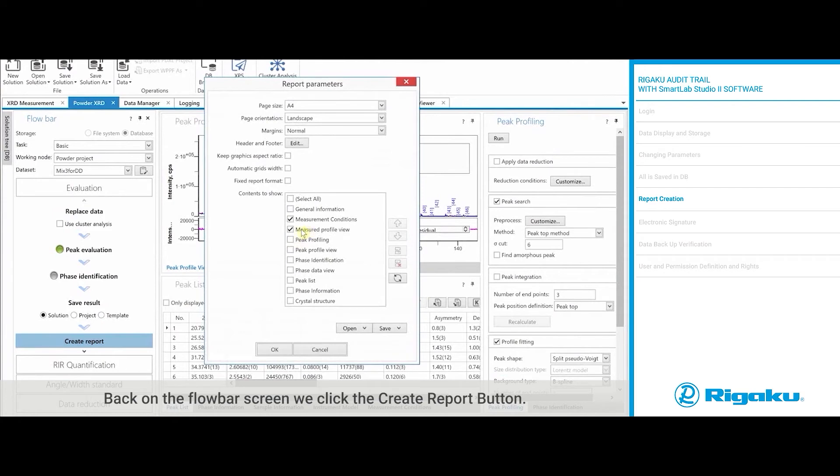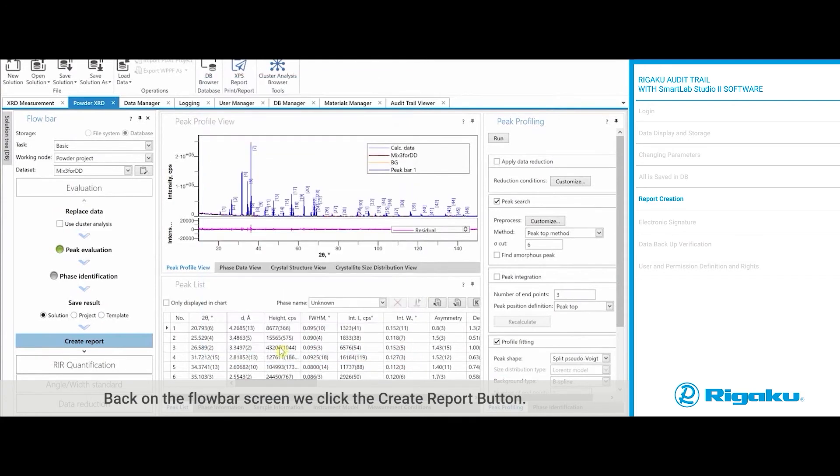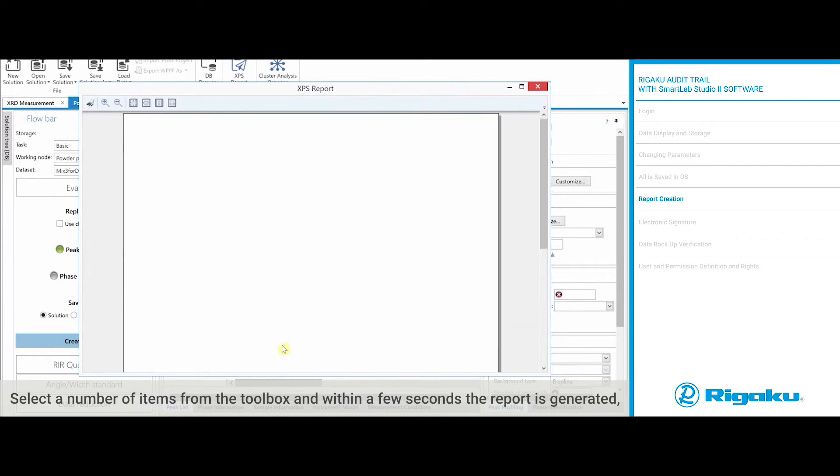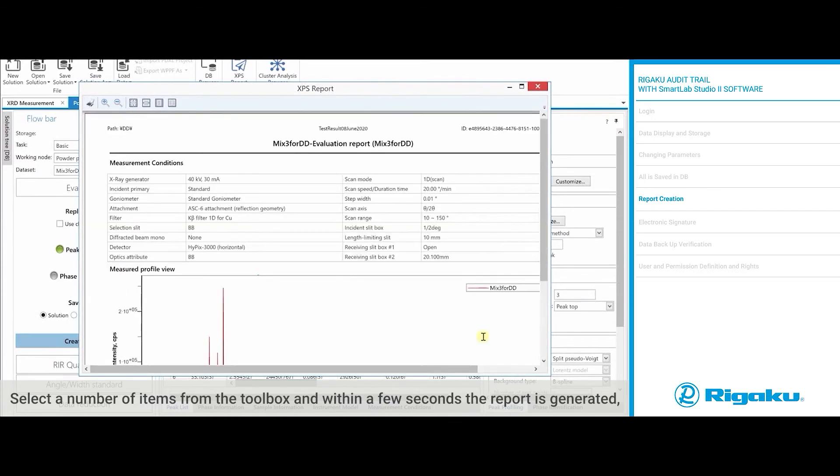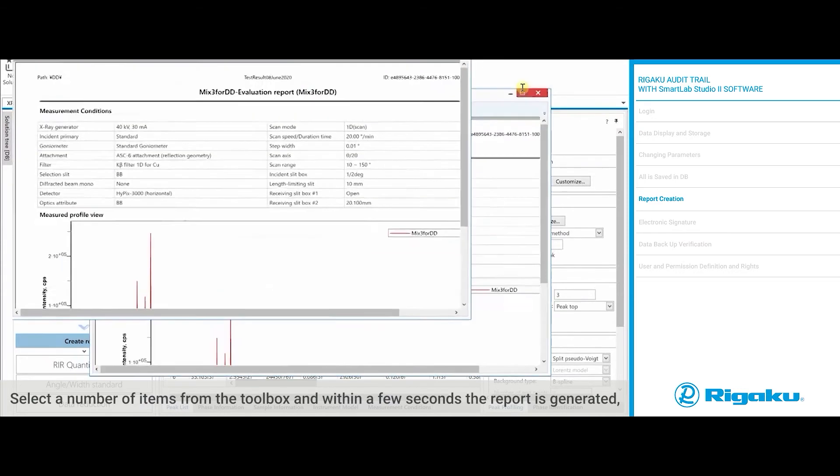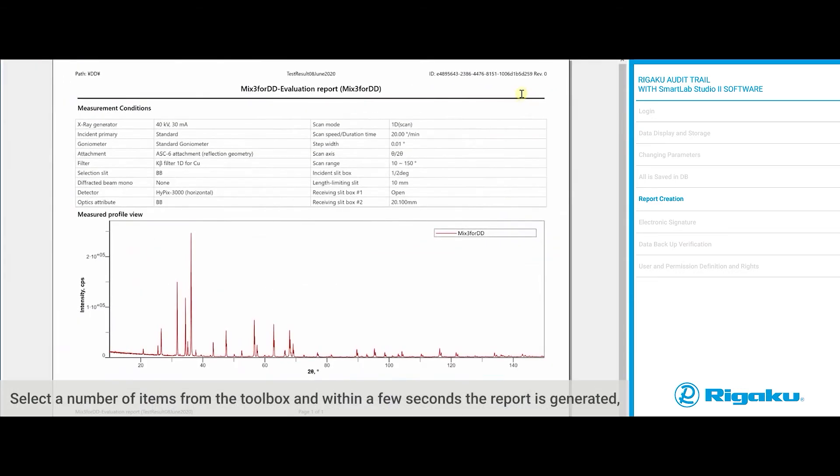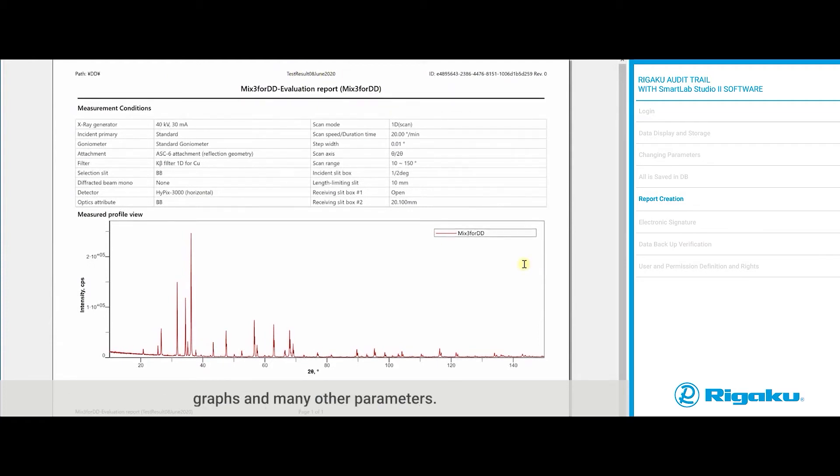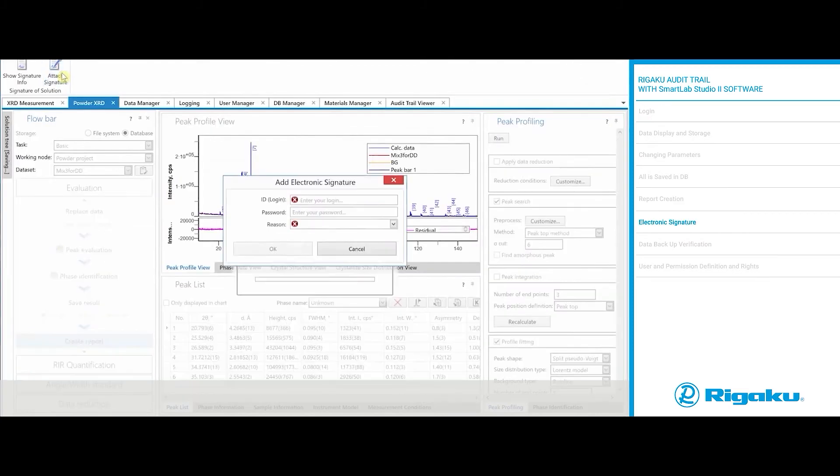Back on the flow bar screen, we click the create report button. Select a number of items from the toolbox and within a few seconds, the report is generated, including a unique identifier, user name, the date, the time, data set information, graphs, and many other parameters.